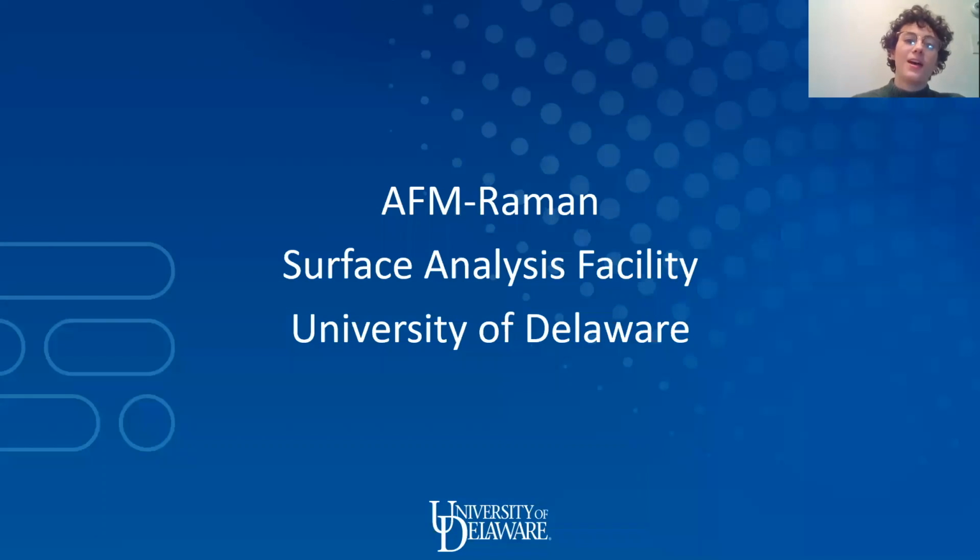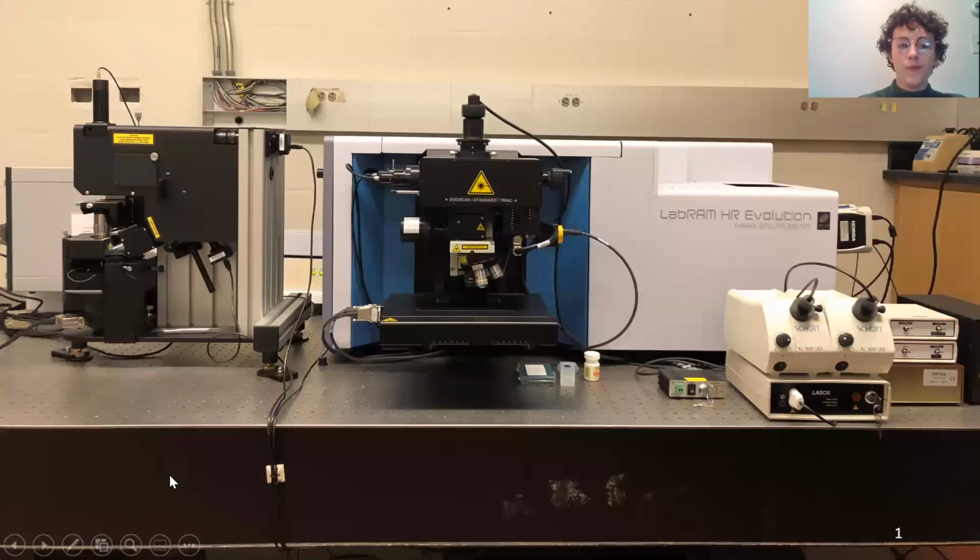Hi, my name's Rachel. I'm an analytical student in the Brooks group here at the University of Delaware. One of the instruments that's available in the surface analysis facility is a Raman microscope coupled to an AFM. This is an instrument that's available for students to be trained on or for groups to send us samples to analyze.